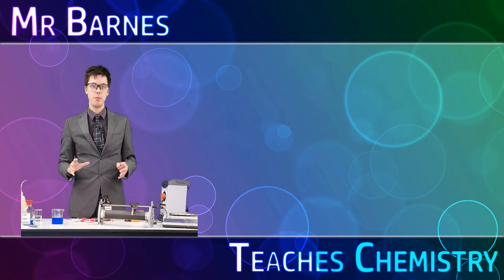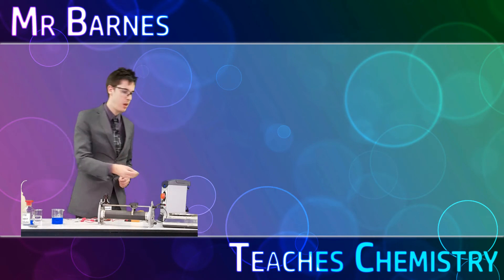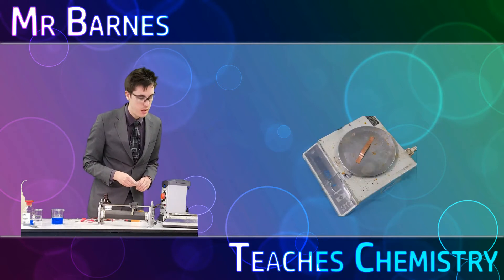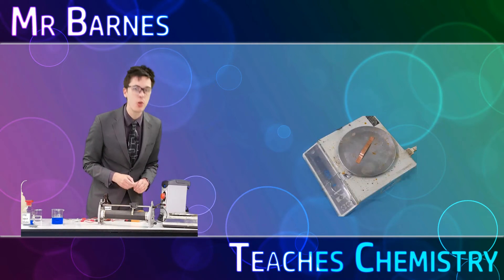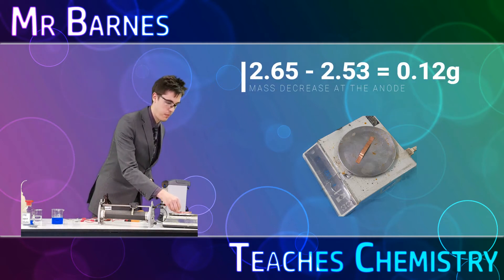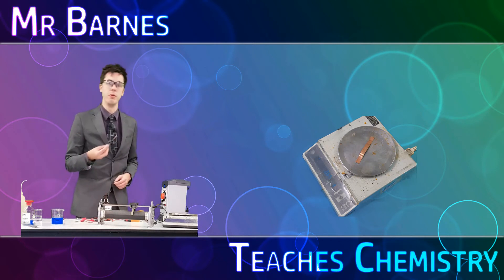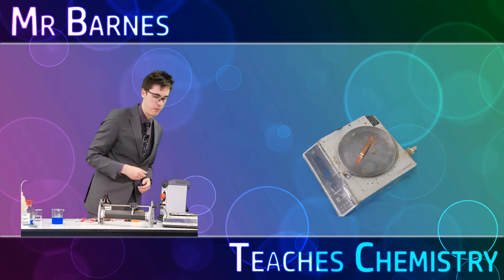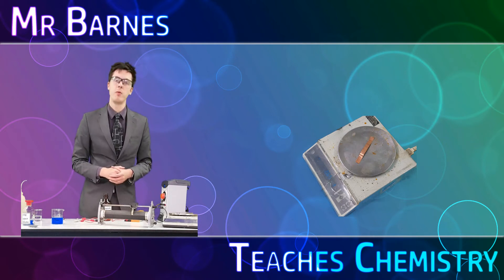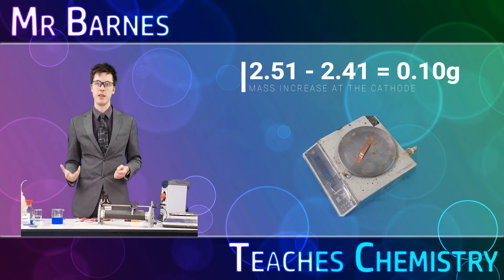It is time to re-weigh the electrodes. The first one, which was my anode and weighed 2.65 grams, now weighs 2.53 grams, so you can see the mass has decreased. My cathode which was 2.41 grams has gone up to 2.51 grams, so the anode has decreased and the cathode has increased.